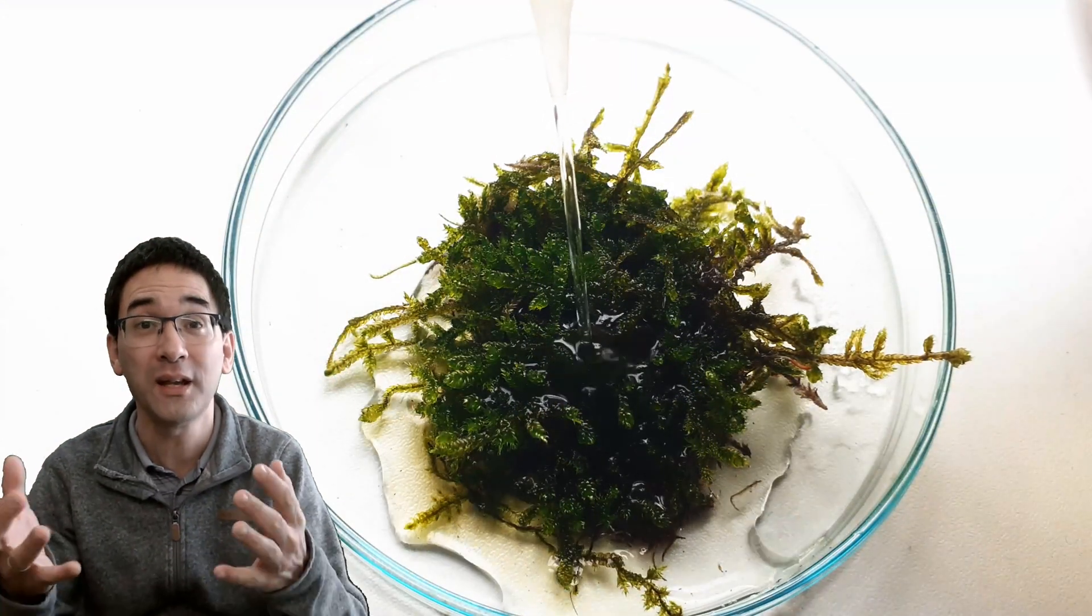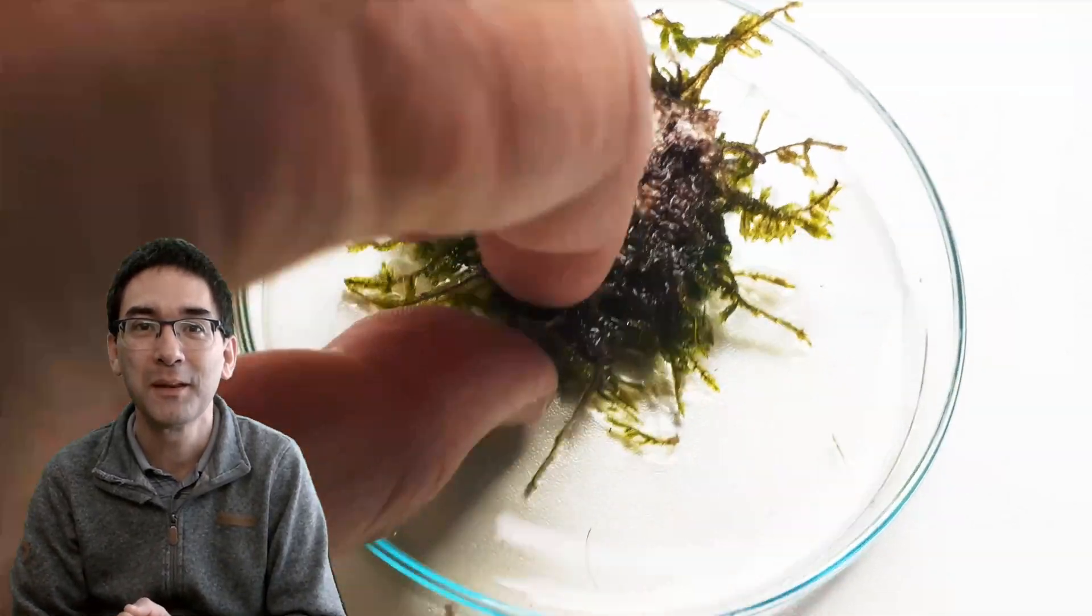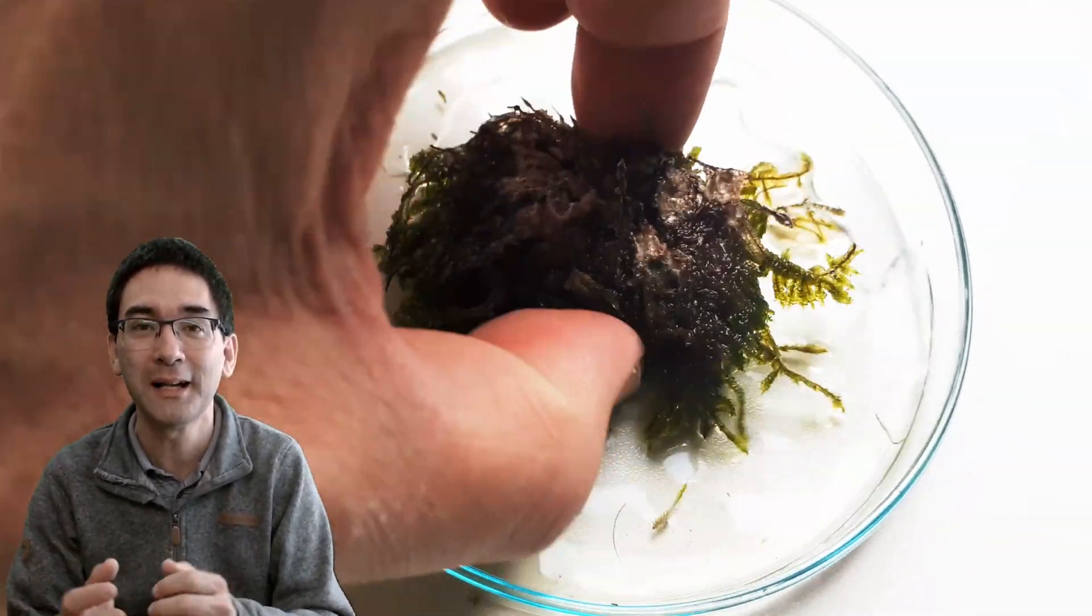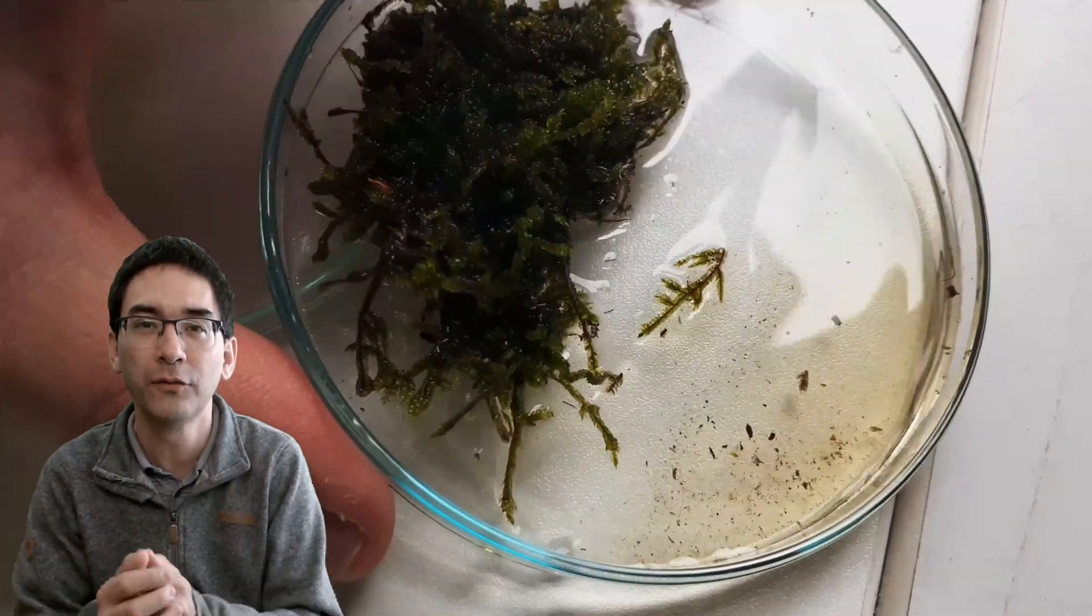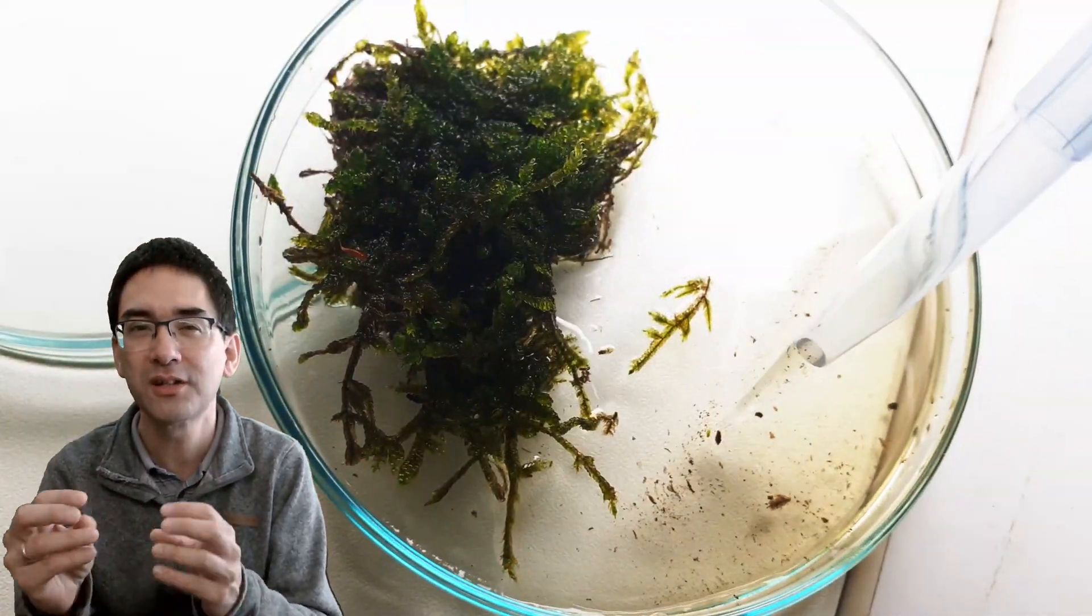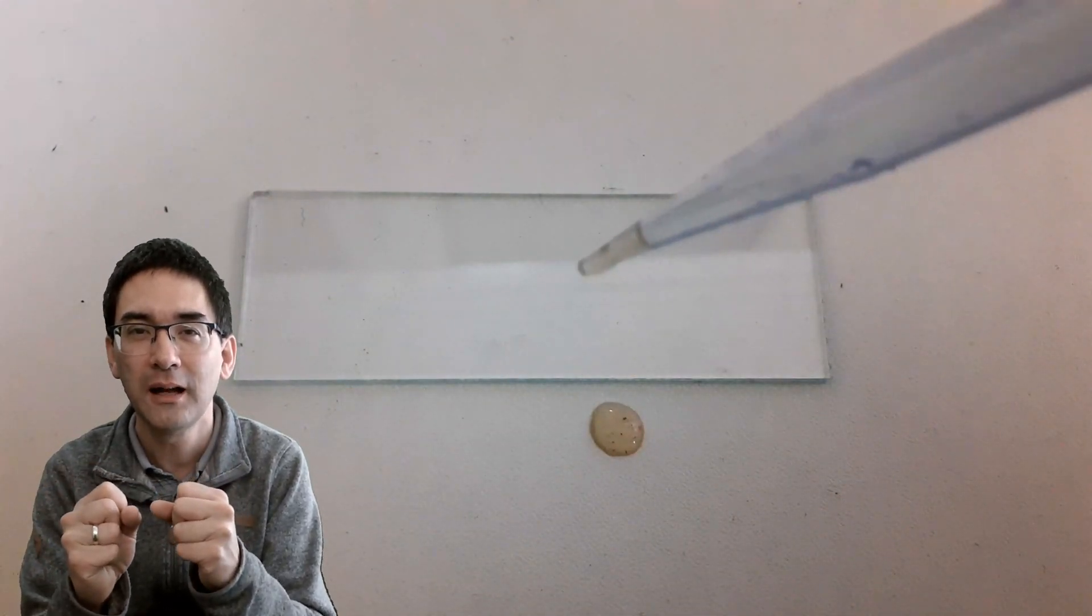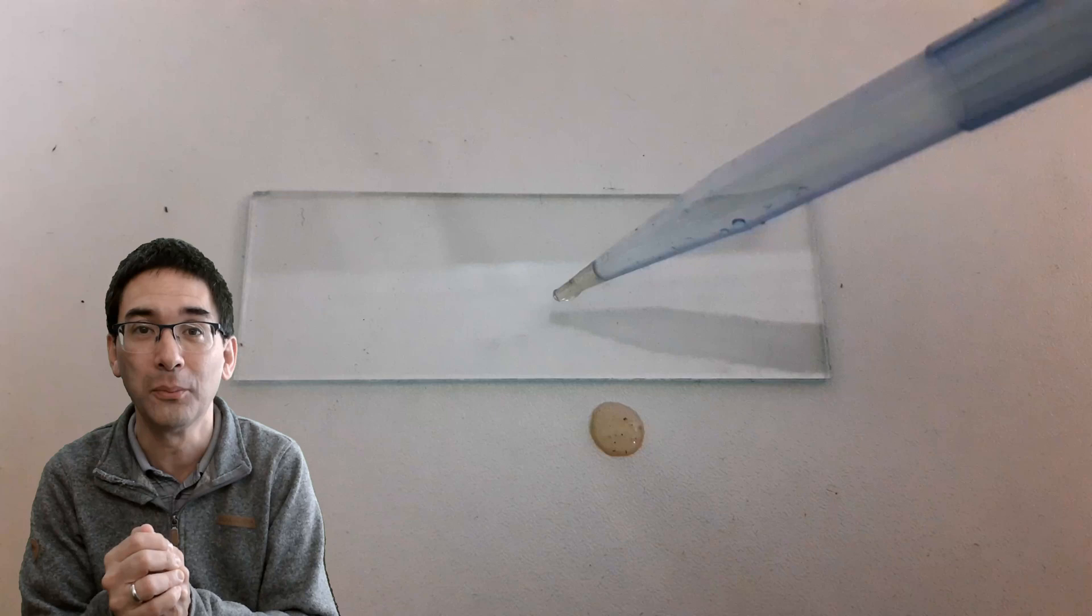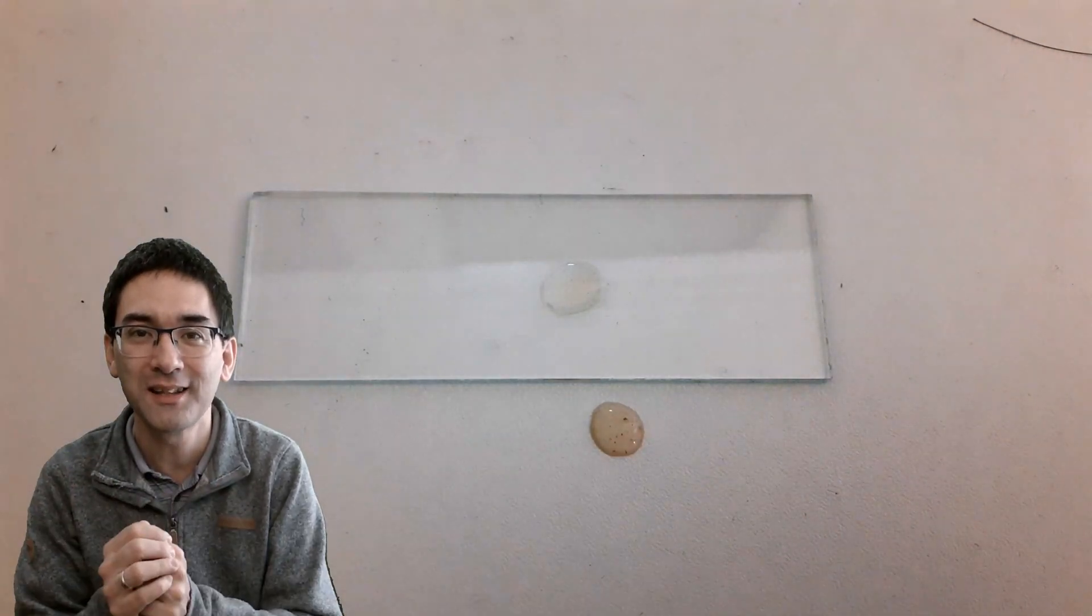And after a few days, I could see that the consistency of the moss was quite different and it was thriving already. And I said, okay, now this is going to be an ideal place to look for some interesting microbes and animals. And I basically washed out whatever came out of the moss. And you can see that there's some leaf particles in there, moss particles, some sand grains a little bit. And this is what I put under the microscope. So a small drop of it under the microscope slide. Cover glass then goes on top.